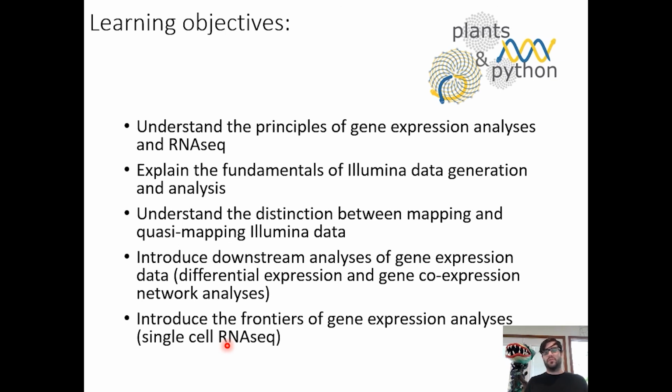And then the remainder of this notebook, what we will be doing is actually processing some RNA-seq data. We'll download data from the Sequence Read Archive, process it, quantify gene expression, and then we will be learning about dimensionality reduction and how we can use that to assess the quality of our RNA. And then in the following notebooks, we will be doing some downstream gene expression analyses.